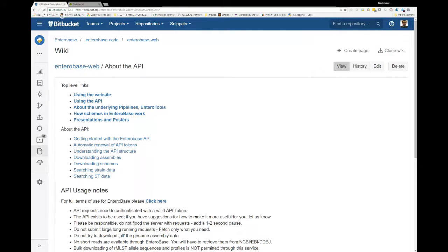So even after 10 days, it just takes too much disk space. So we only keep one copy. So you can't just grab a static dump of, say, what the database was 30 days ago or 3 months ago. You would have to take the dump that's there and then filter out all of the records that have been added since using the API.